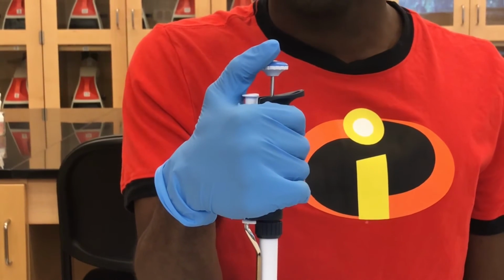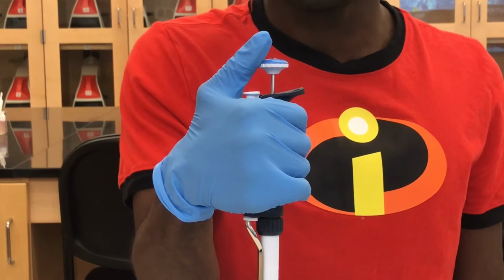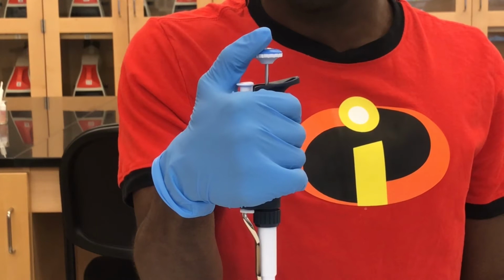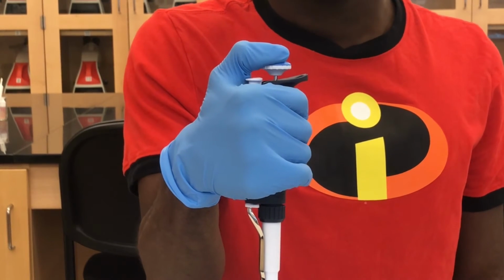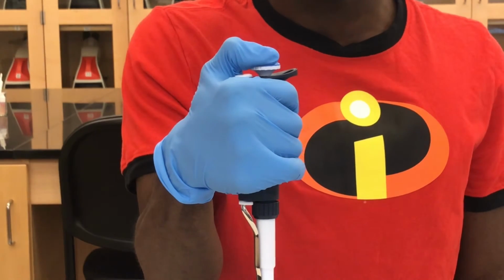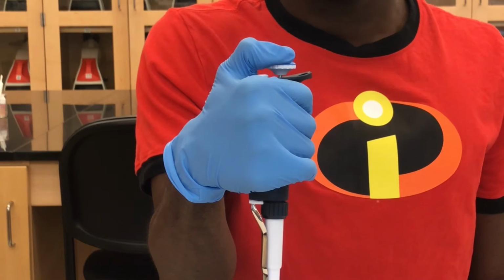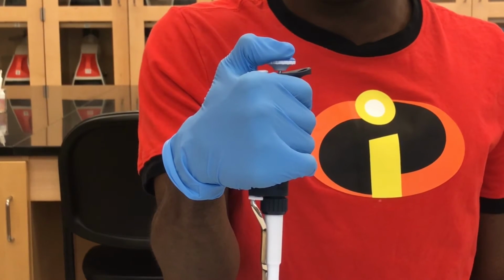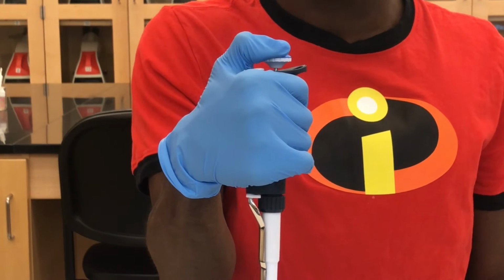Liquid is picked up and expelled using the plunger at the top end of the micropipette. The plunger is operated by pressing down using your thumb. There are 2 different stop positions when you press. The first stop is the point of initial resistance, or the load line. The second stop is reached when the plunger is depressed beyond the initial resistance, or is in contact with the body of the pipette. In this lab, only the first stop will be used to pick up the liquid. The second stop should only be utilized to completely expel liquid from the tip.